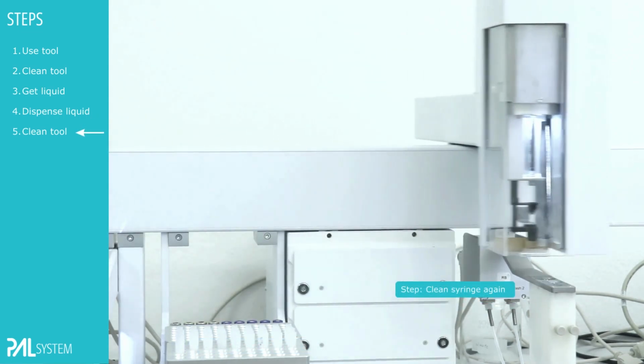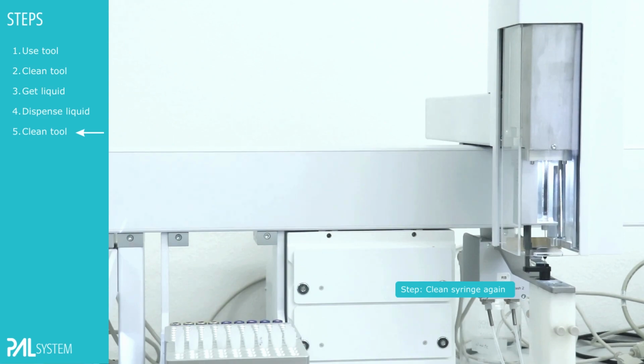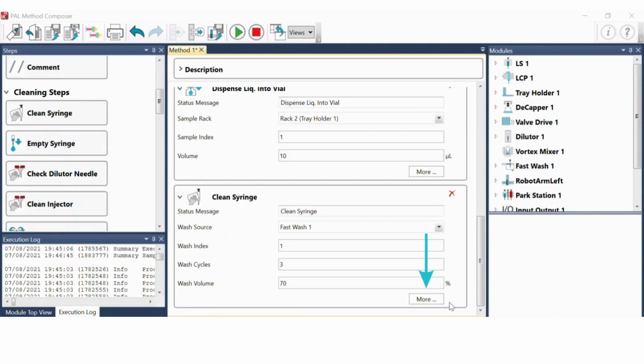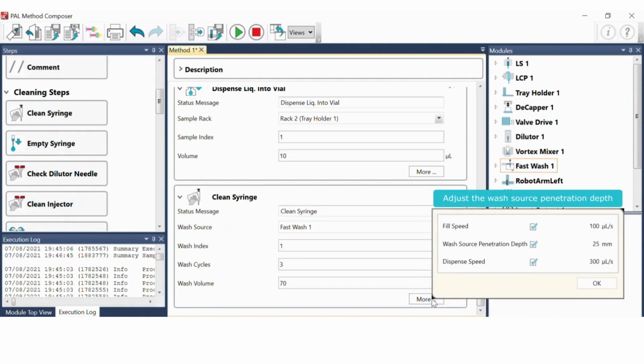If you notice aspects in the current method that need adjustment, you can change additional parameters beyond the default preset values in all the steps. To do so, we will now look at how to adjust additional parameters. In the Method pane, click on a step and further on More. Here, you can edit additional parameters that were preset. To change a value, unclick the box and edit the value.